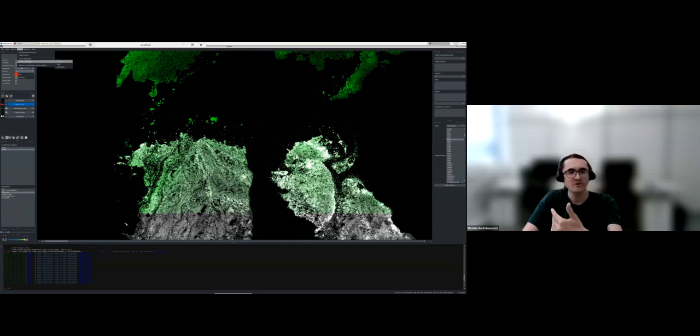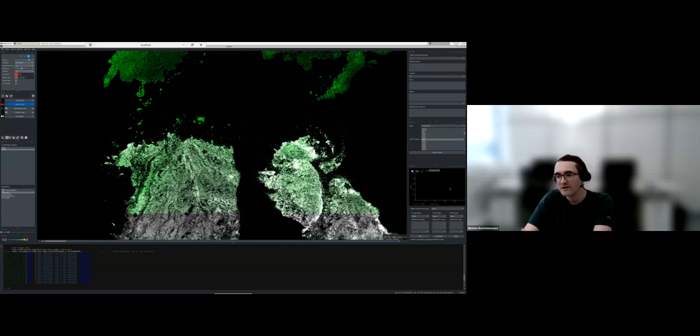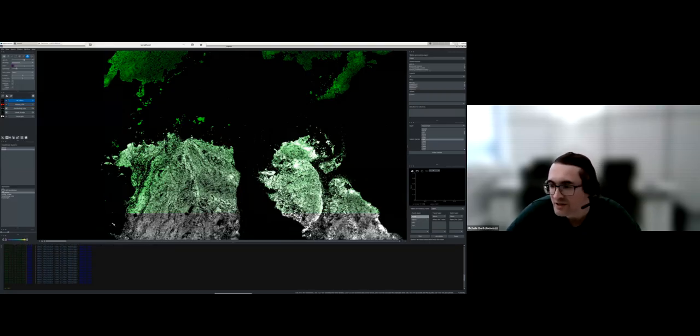But because this is napari, we can even explore a bit more. There are options to also do, not of course a full analysis suite, but a little bit of quick exploration without code. Here I need to go back to the cell labels. And here I have the option to select what I want to show up on the plot.